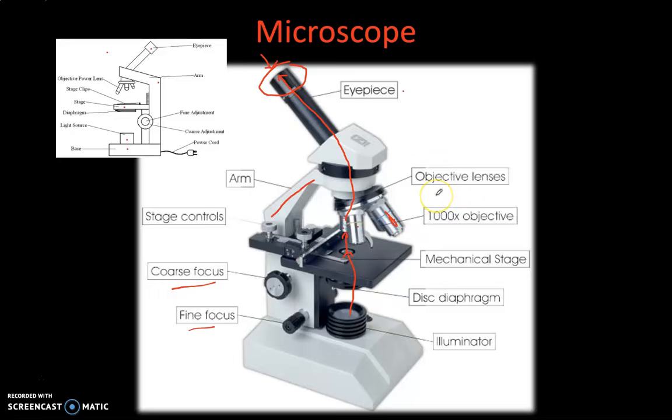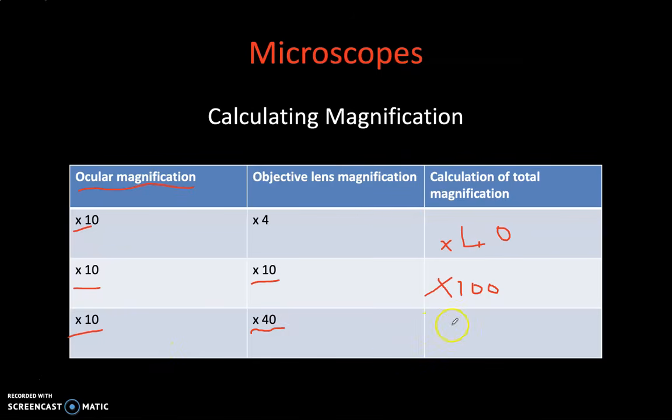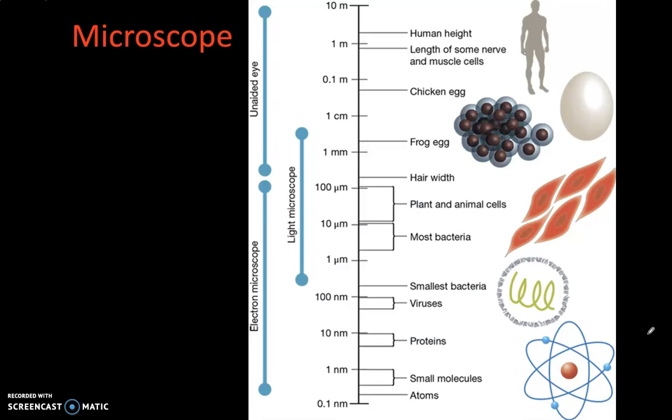That's a ×40 magnification. And so here you're looking at specimens at ×400 magnification. Really, really up close. And it's some of the detail you can see, if you can get the focus right, is just awesome. I can't wait to show you.